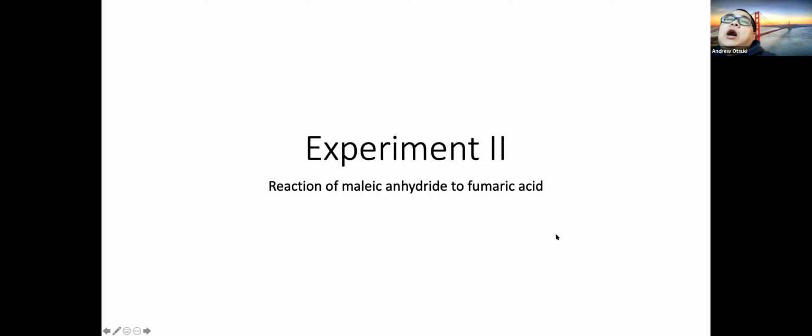You'll learn about anhydrides when Dr. Levins talks about carboxylic acids, and when she goes into biomolecules such as sugars, amino acids and proteins. This comes from a dicarboxylic acid, so a carboxylic acid that has 2 acidic groups at the ends. When we dehydrate, remove water from this molecule, we get maleic anhydride. But in this case, we want the acid, so we're going to take the anhydride, hydrolyze it with water, break up the ring, and form the maleic acid.